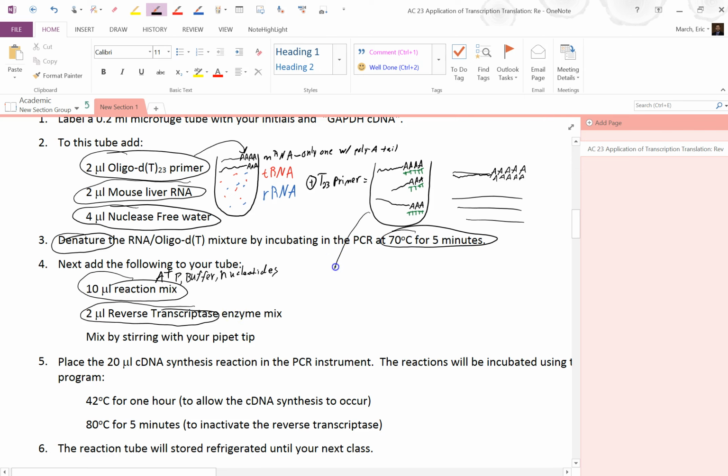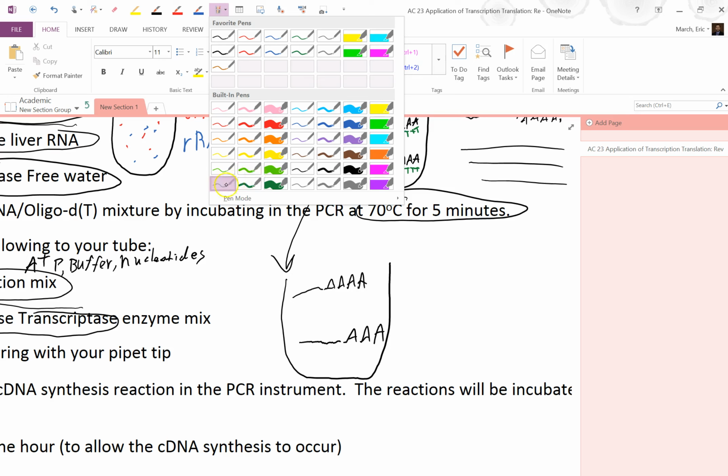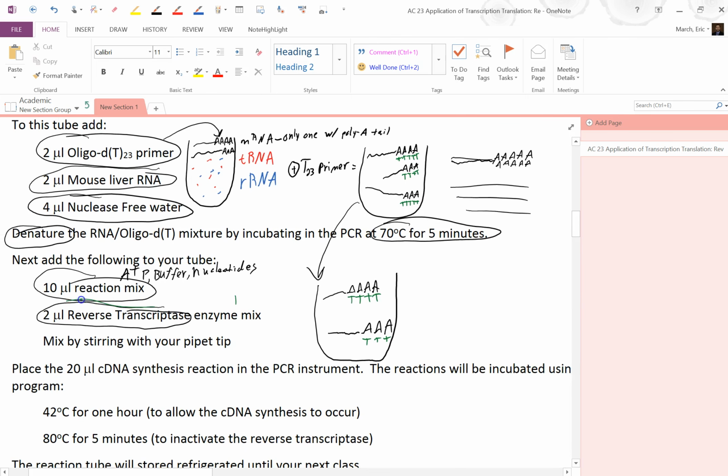And so we'll draw our tube down here. So here's our tube again. Same tube. Right? So we're going to have our poly A tails that are all in here. And of course, we added our primer T in green here. So the T's will bind to the A's. Right? And so then this reverse transcriptase in green, here, I'll circle it in green. Right? It will go back and it will run this way. And it will make a DNA copy from the RNA template.